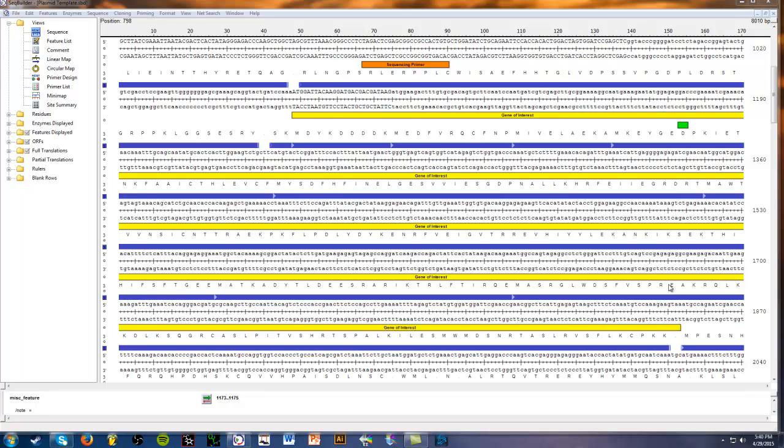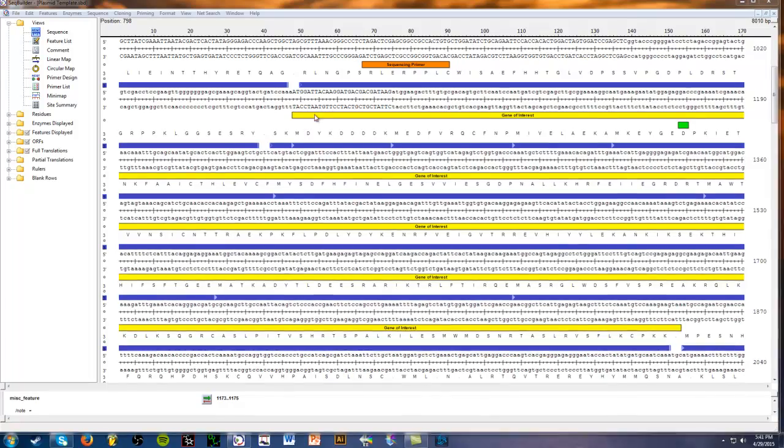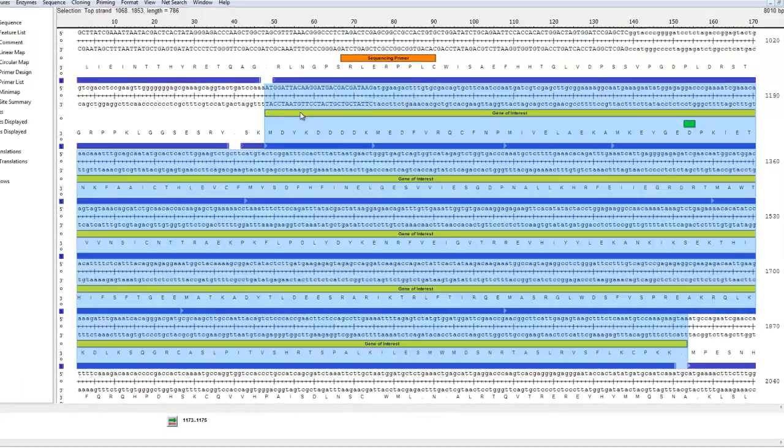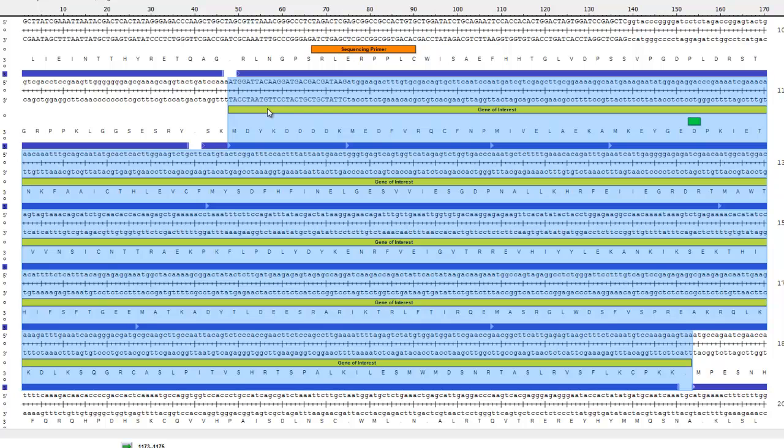So here's your plasmid with a gene of interest inserted in. Let me just go over what you're looking at. By the way, this program that I'm using is called SeqBuilder, and it is also part of the laser gene suite. I did a video about this a few years ago, so if you want to learn more about this program, you can check that out. So in yellow here highlighted, basically annotated, is my gene of interest.